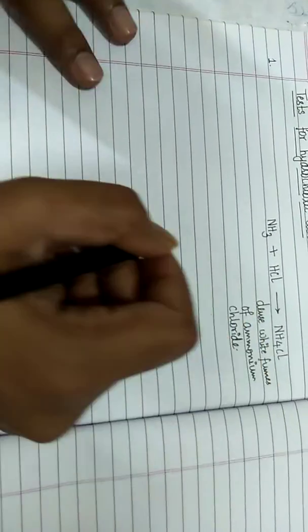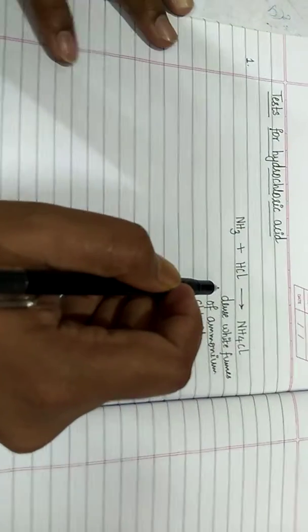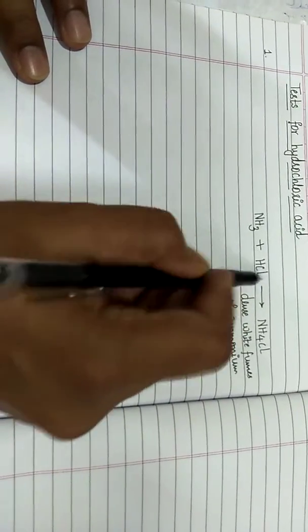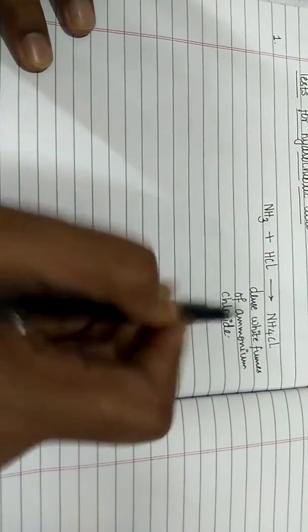So the observation is, when a glass rod dipped in ammonia solution, which basically means ammonium hydroxide, is brought near a gas jar containing HCl, we get dense white fumes of ammonium chloride.